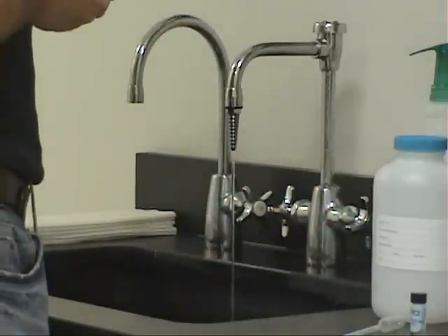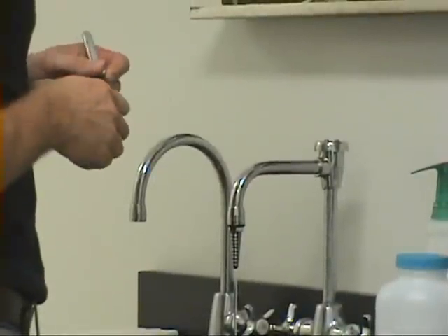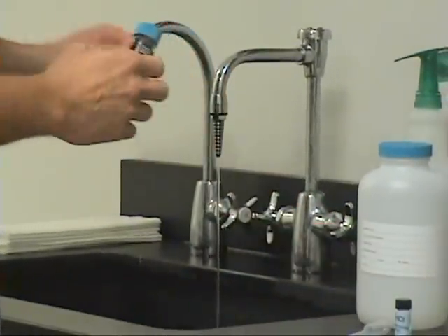Mark sample bottles appropriately. Run cold water tap for 3 to 5 minutes. Reduce flow of water to a light stream and fill vial to about 1½ inches from top.